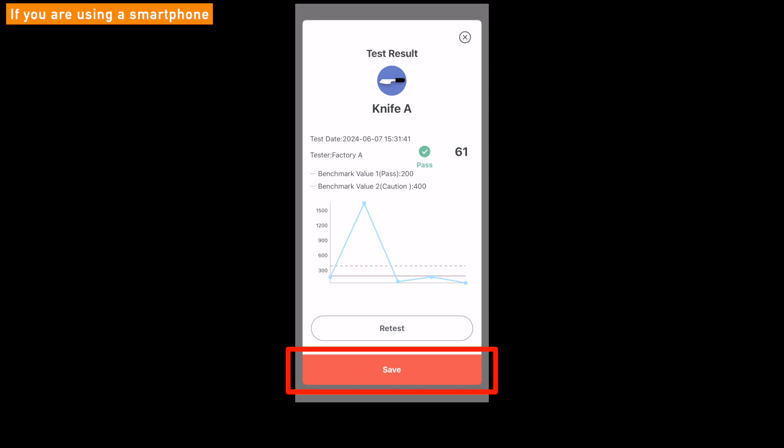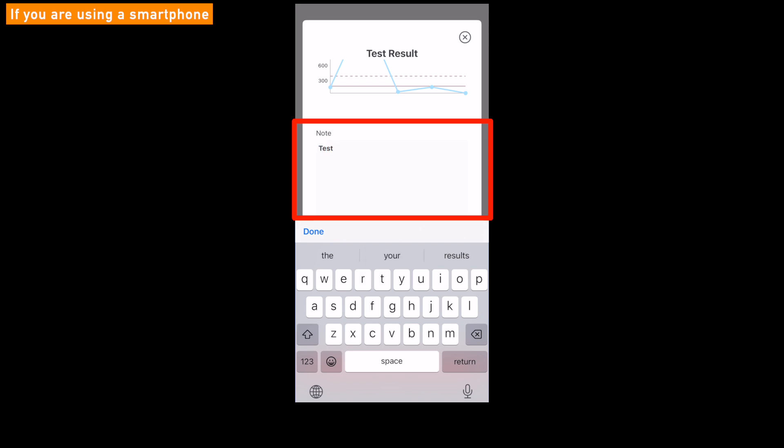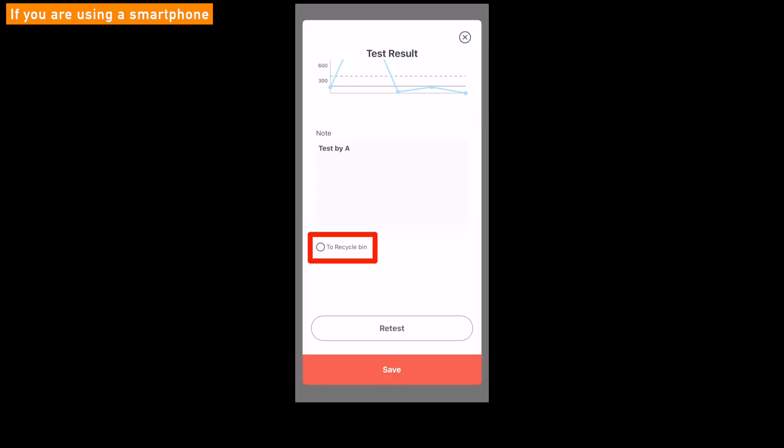Click the Save button to save the result. Also, you can scroll down the page to find note fields to take a special note, or check the To Recycle Bin checkbox and click the Save button to delete this result.